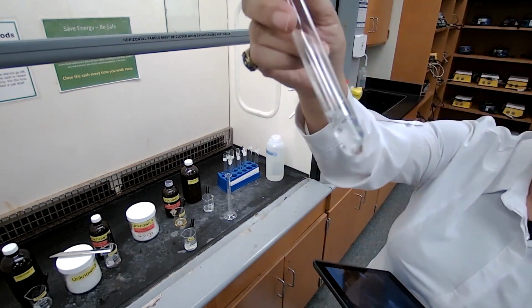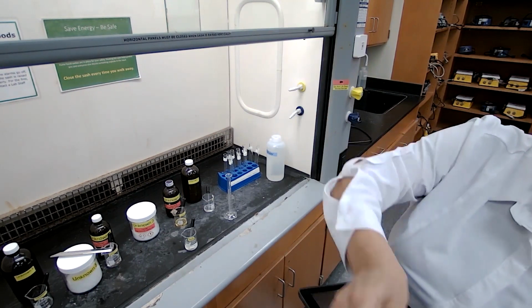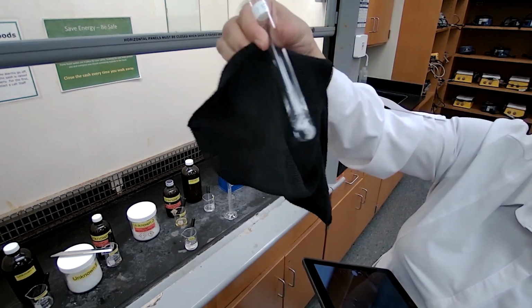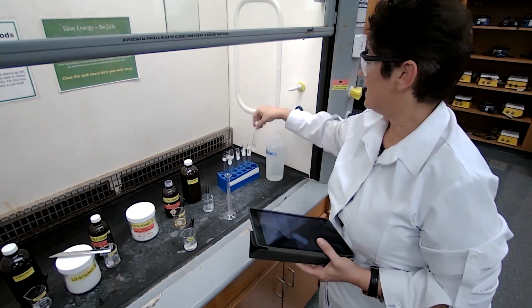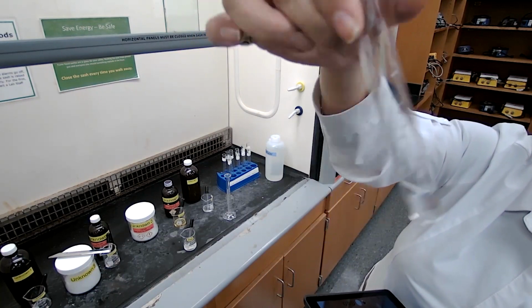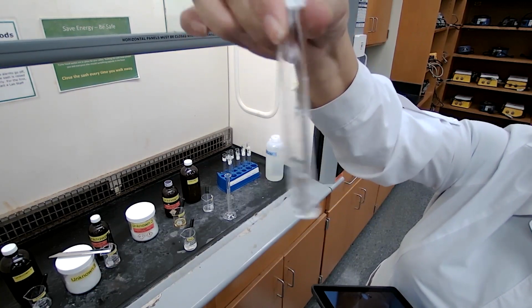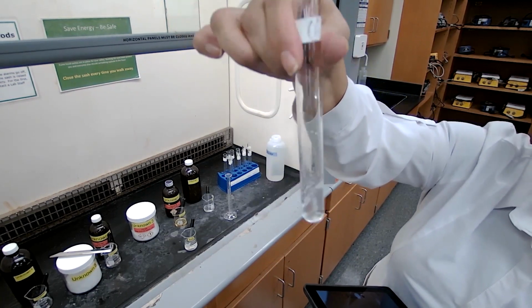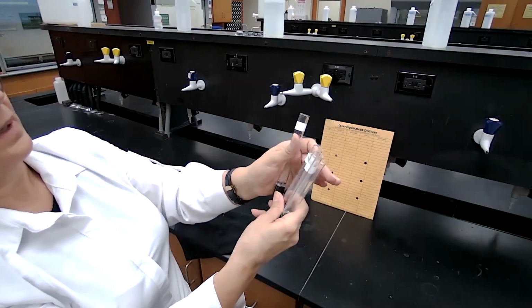Unknown 5 is a solid compound, not soluble. It did not dissolve, and we're going to show it with the black background. It's visible that none of it dissolved. So 5 did not dissolve. And unknown 6 also shows very oily right here, so it's not soluble. So none of the unknowns actually dissolved in water.